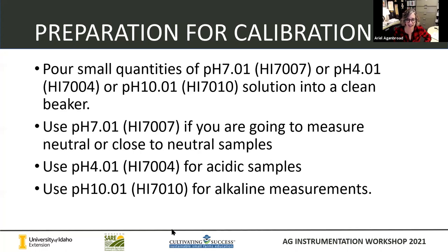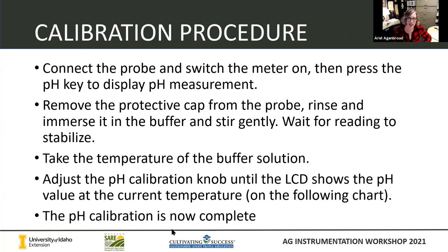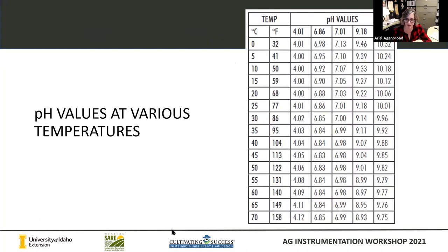Basically, just pour a little bit of this solution into a clean beaker, connect the probe, put the meter on, and put it in that buffer solution. You might wait maybe up to ten minutes just for that reading to stabilize and for your temperature to kind of regulate. It's also a really good idea to take the temperature of the buffer solution, because to be really accurate, pH is going to change slightly based on the temperature of the solution. You'll adjust your pH calibration knob until the screen shows the pH value at the correct current temperature, and then your calibration will be complete.